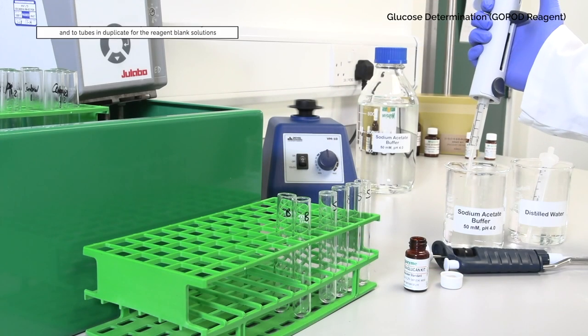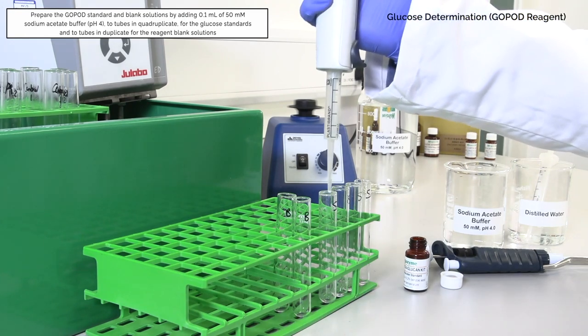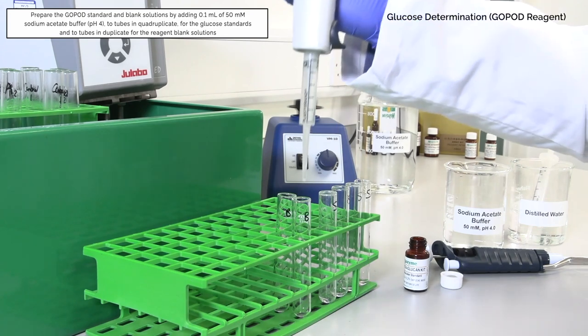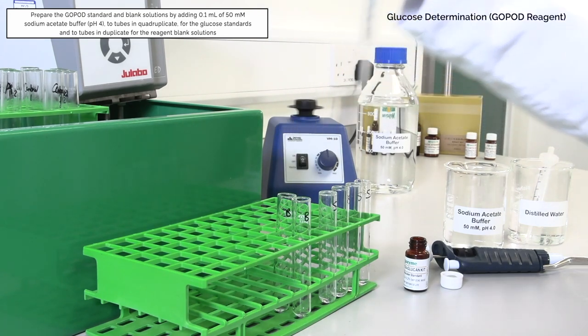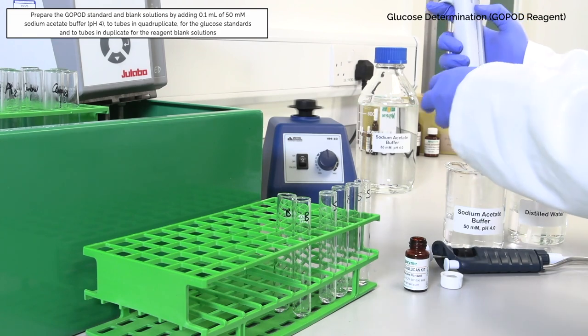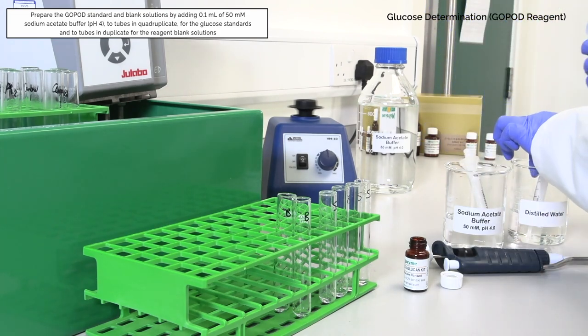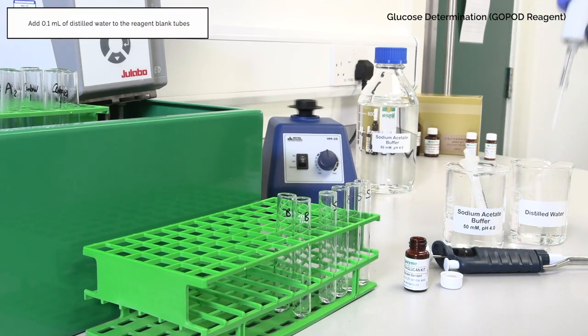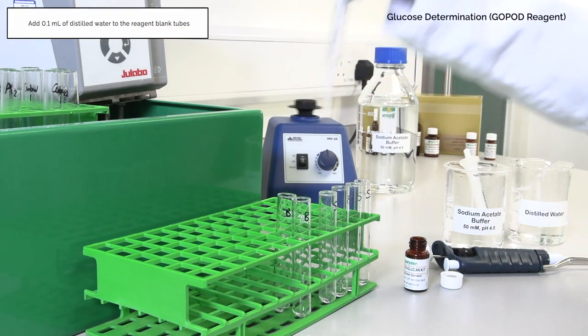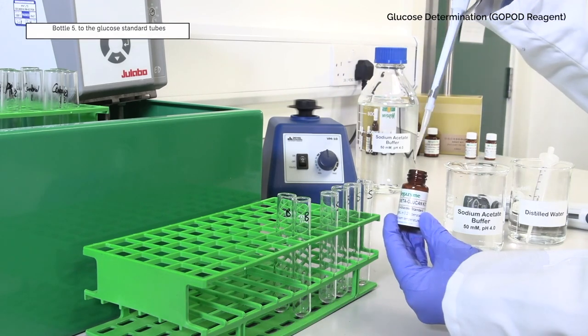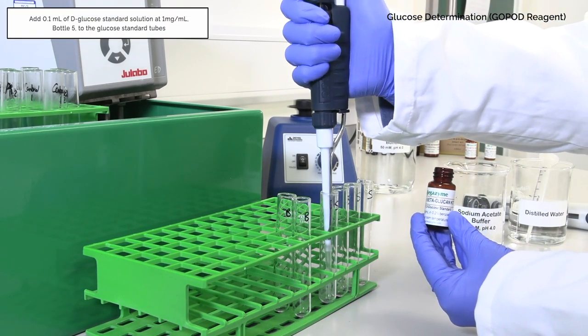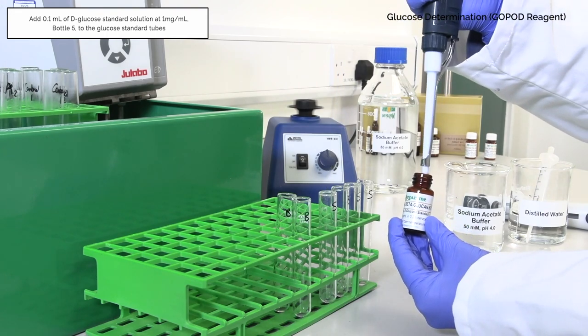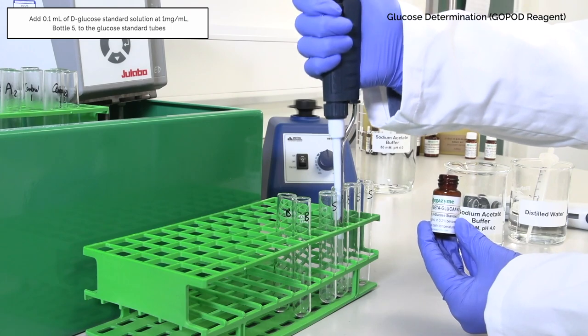During the incubation period, prepare the GOPOD standard and blank solutions by adding 0.1 milliliter of 50 millimolar sodium acetate buffer pH 4 to tubes in quadruplicate for the glucose standards and to tubes in duplicate for the reagent blank solutions. Subsequently, add 0.1 milliliter of distilled water to the reagent blank tubes and 0.1 milliliter of the glucose standard solution at 1 milligram per milliliter, bottle 5, to the glucose standard tubes.